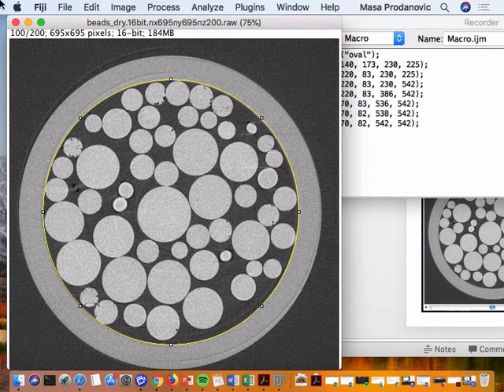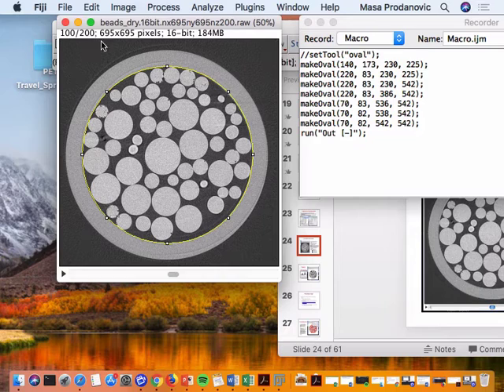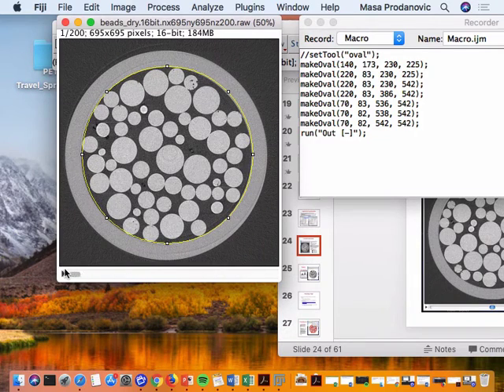Okay. Next thing you will actually notice, whatever fits in this frame is not necessarily what always fits the same in other frames. Ever so slight shift. Well, there might be ever so slight shift. We're talking about microns here. Okay?